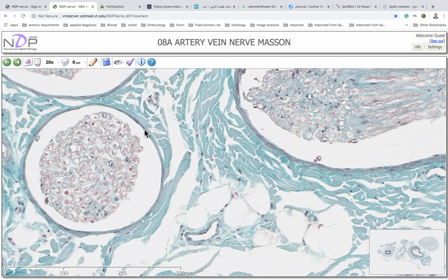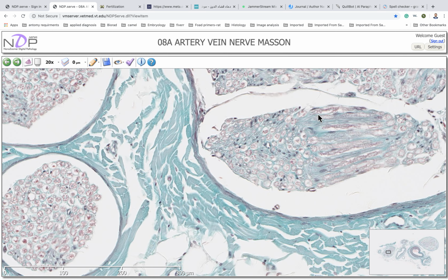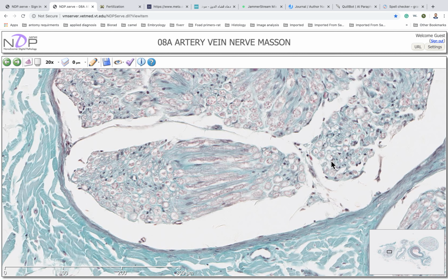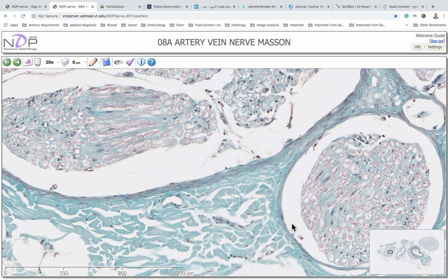This should be the non-myelinated, and this is a bundle, and this is the space, the perineural space, and we can see here all of these structures are the myelin sheath. As I said, these are similar to donuts or car tires. See this one here without a myelin sheath, all of these are non-myelinated. And the connective tissue here, this is the perineurium, and the space that we found here, this is the perineural space.